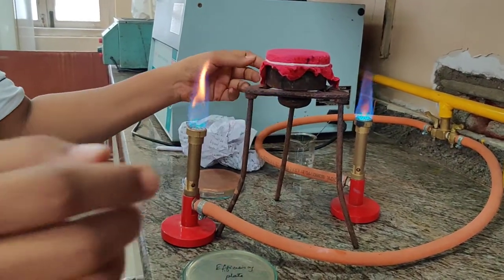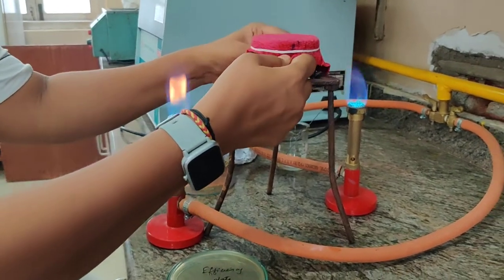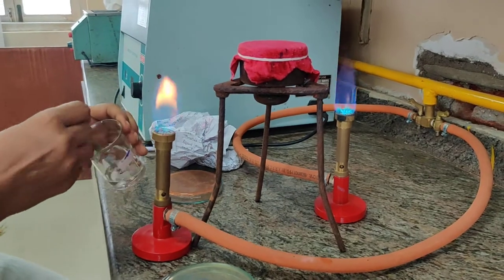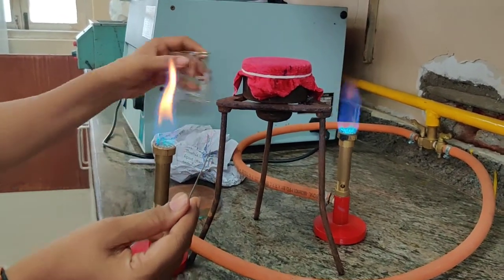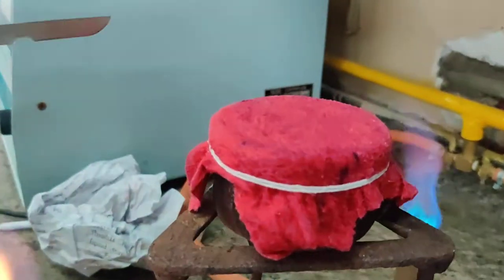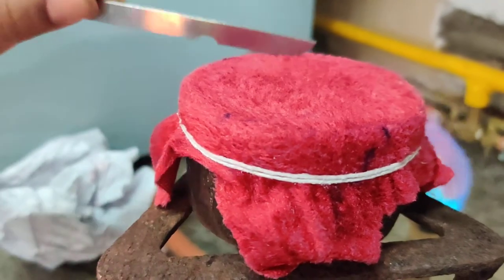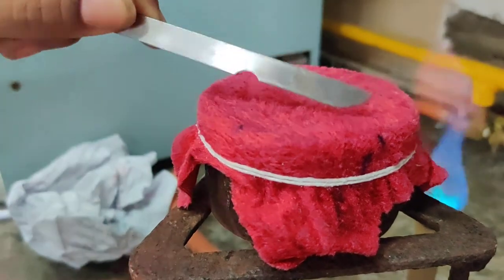Before we proceed, we are going to pull the cloth down tightly. After which, we are going to take a scalpel, flame sterilize it, and make the fibers of the velvet straight and erect so that they can act as inoculating needles.